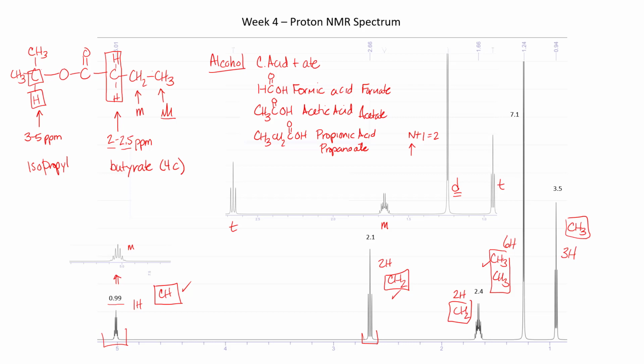I chose this one because we've eliminated butyric acid. We eliminated butyric acid this semester because it just reeks. And so we got rid of that, and we only used acetates and formates. As far as the alcohol group goes, could be anything. So this student unknown is isopropyl butyrate. And so that's what you have to look up on the chart.